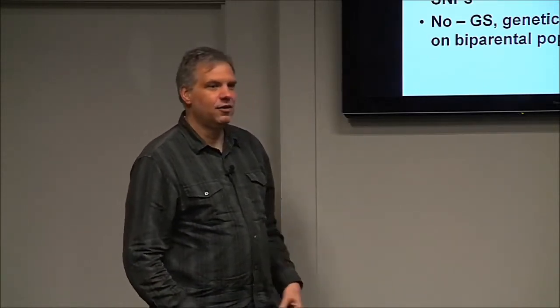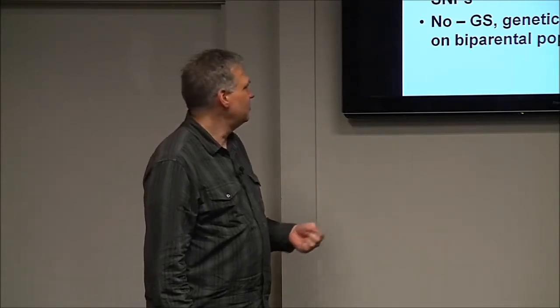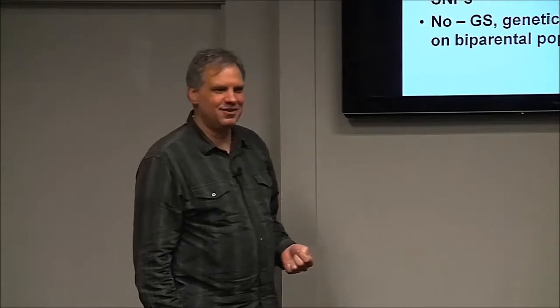SNPs that look IBD above some threshold. And if you get a collection of those for that particular segment, for that particular haplotype across individuals, you can start to see where the error-prone SNPs are and just set those to missing or set them to major allele or something like that. So that's even harder than the multi-parent situation. But I think the multi-parent situation is pretty similar to the biparental, really, once you have enough depth on the parents.